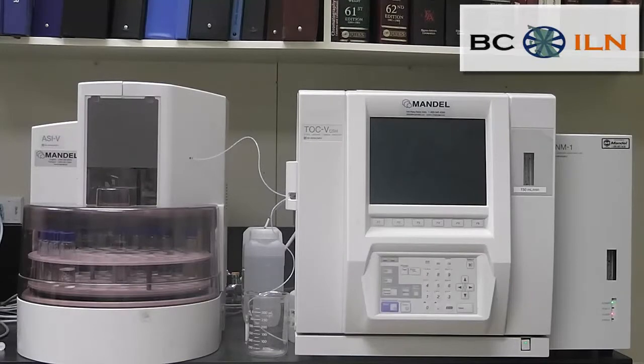Hi guys. Today I will be talking to you about how the instrument, known as the Shimadzu TOC-V, works to analyze total nitrogen. This is what our instrument looks like at Thomson Rivers University in Kamloops, BC, Canada.